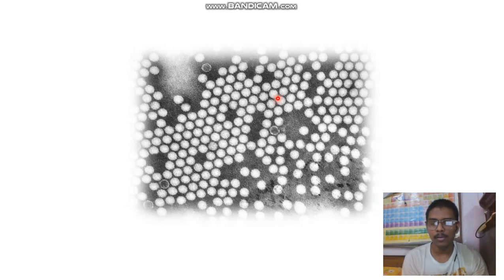Transmission electron microscopy can go to a resolution of 0.019 nanometer, so it can go to subatomic resolution. But a light microscope can't reach that; it can go only up to 200 nanometer. That's why light doesn't interact here, and electron is interacting, which makes the contrast of your image.